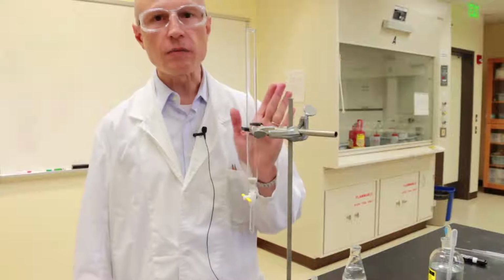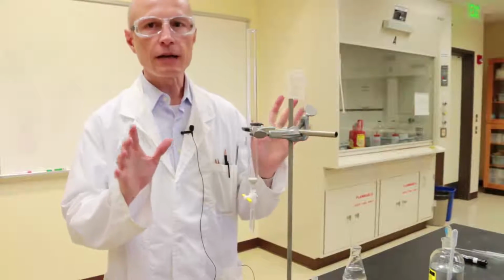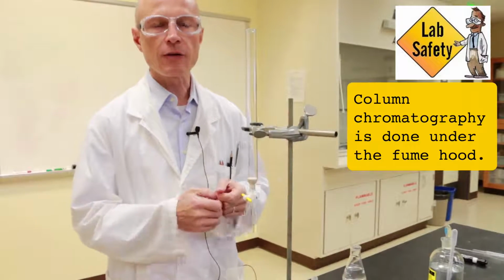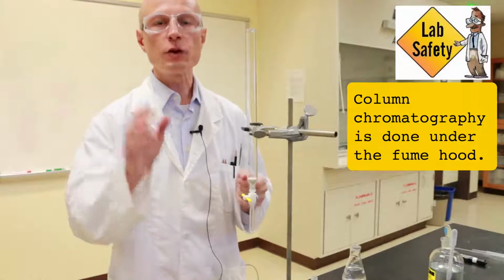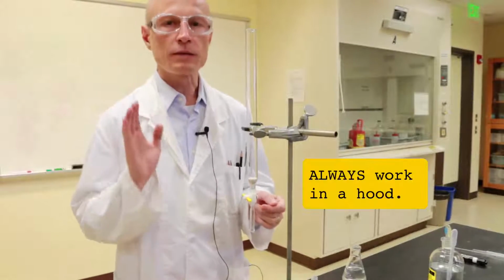Today we are talking about column chromatography. Everything we are doing should be done in a hood because we are using volatile organic solvents. For video purposes we are doing it on the benchtop, but remember, always work in a hood.